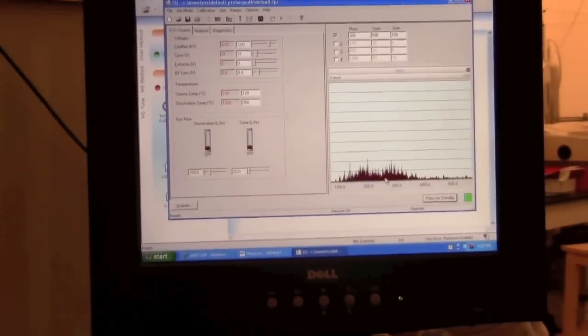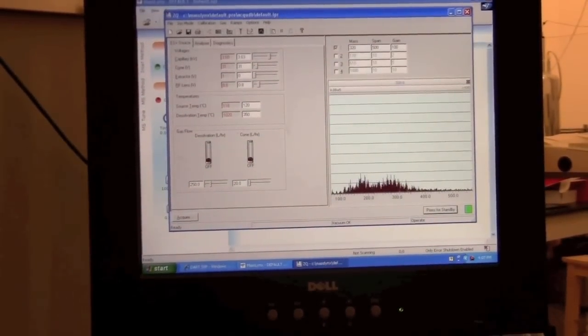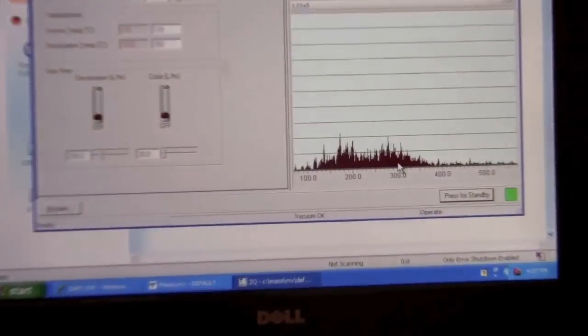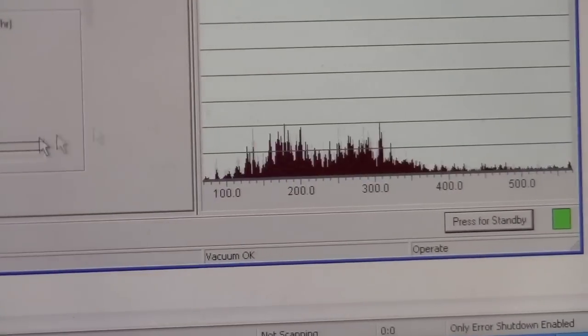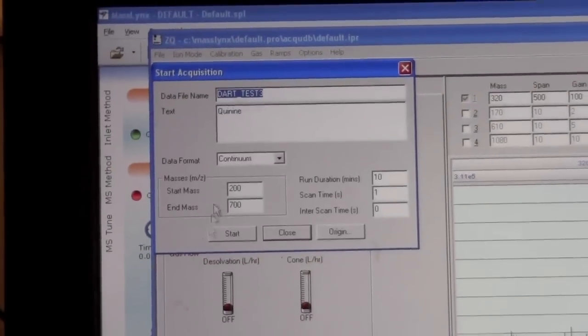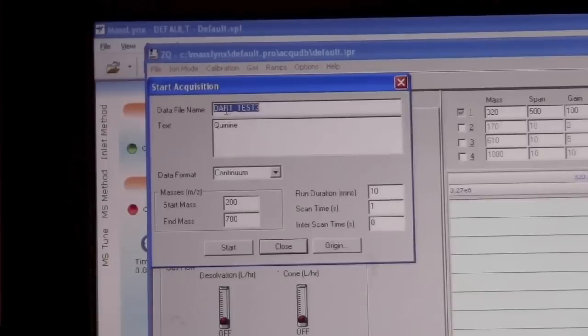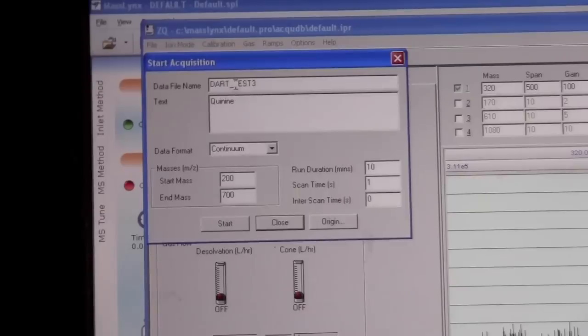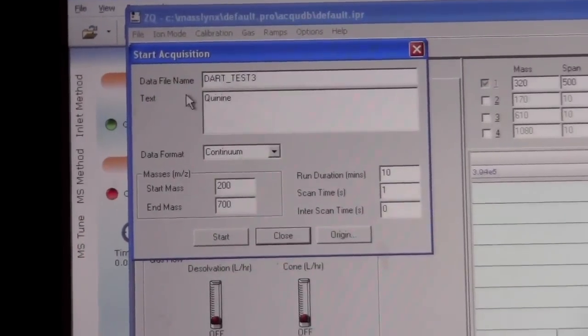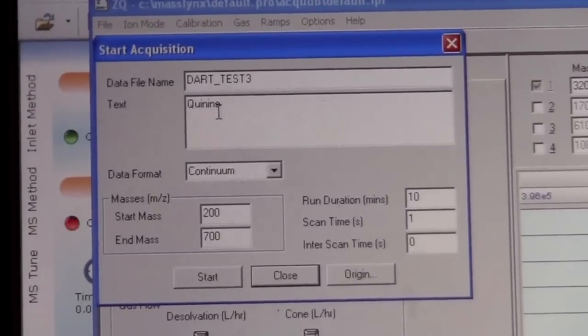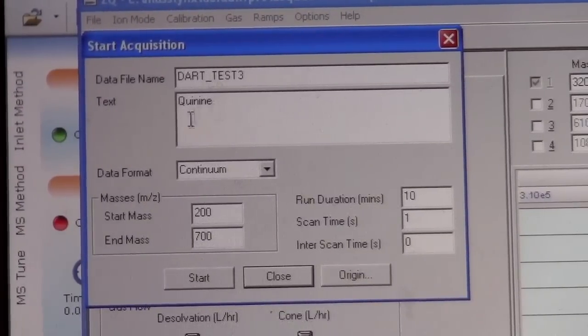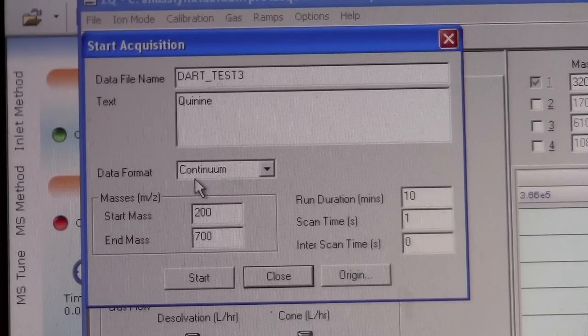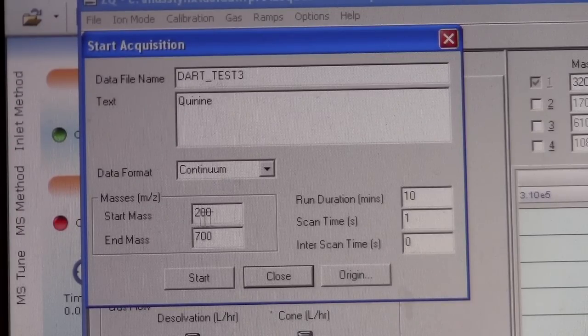We go back here we can see that there's a lot more ions coming into the mass spectrometer. So now we want to start an acquisition. To do that we can click the acquire button. Here we can put in a file name. This name needs to be one that's appropriate to be saved to disk. We can put in text based on what we want to have saved with the data.